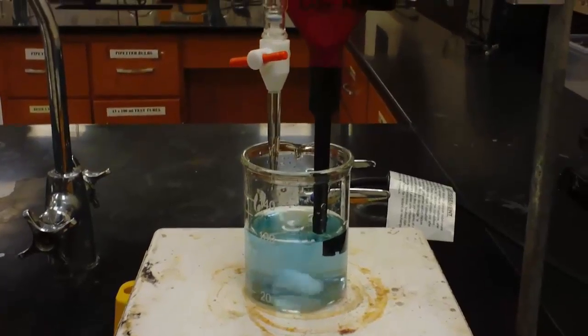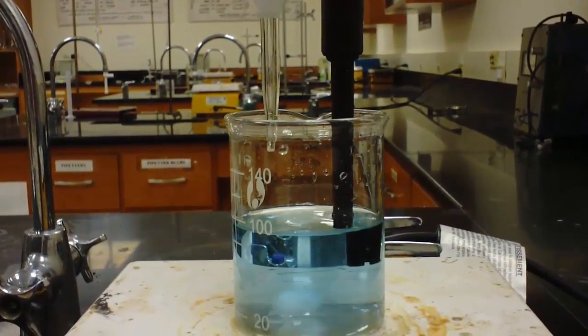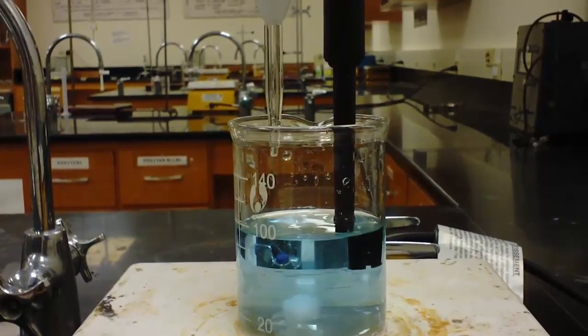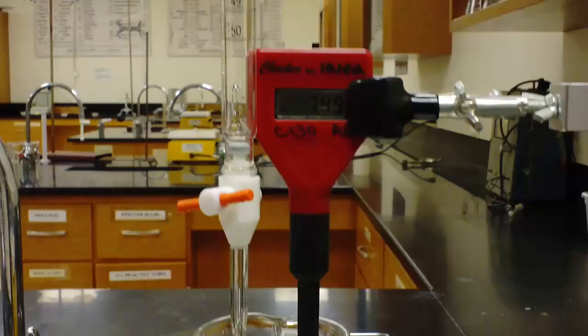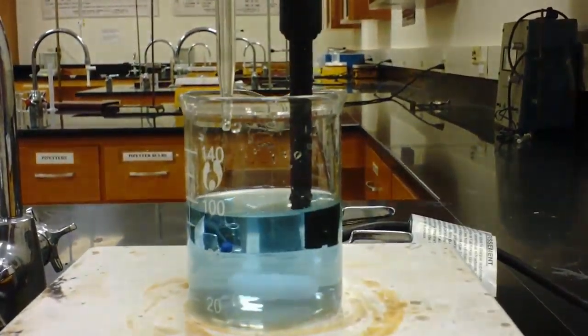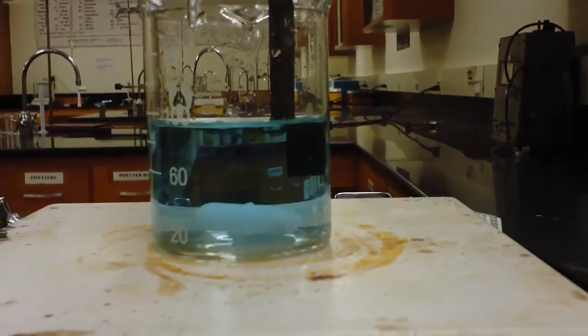You want to have the burette set up so that the tip of the burette is below the top of the beaker so that you make sure all the liquid goes in the burette. You want to have the pH meter so that first of all you can read it, second of all so that the bottom is in the liquid and so that the bottom is above the spin bar.